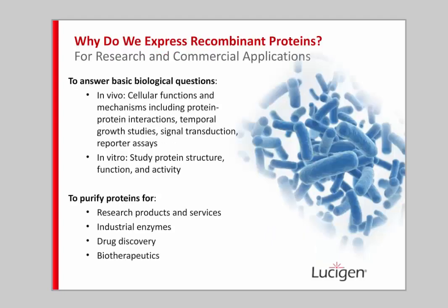So let's first talk about why we overexpress recombinant proteins. We know that recombinant proteins are used for both commercial purposes and to answer basic research questions. And expressing a recombinant protein inside a cell allows us to study the protein's function. For example, identifying other proteins it interacts with, or when and how the protein is expressed, or what function it may have in a signal transduction pathway.